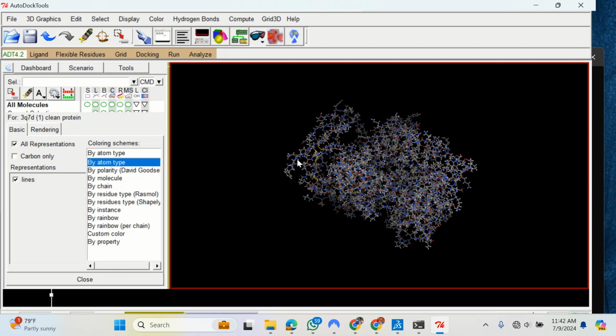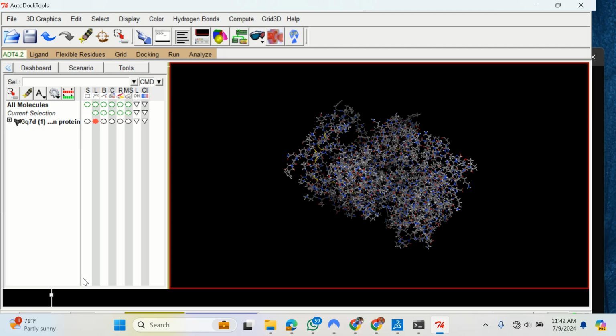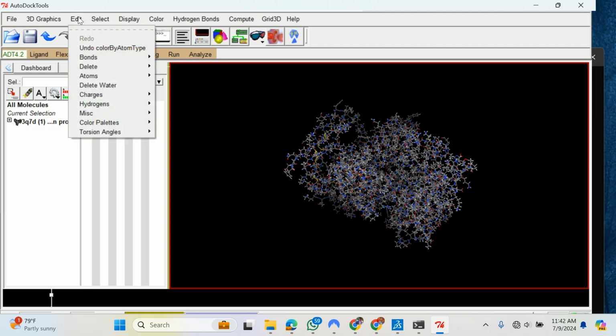However, like I said, some of them are not here because of the crystallography method of elucidation; some of them were lost. So it's part of what we are going to edit now. So I can now close this. That is clear, right? So I can now go to my edit button to start editing. So I'll click on edit, and then I will come down to charge.